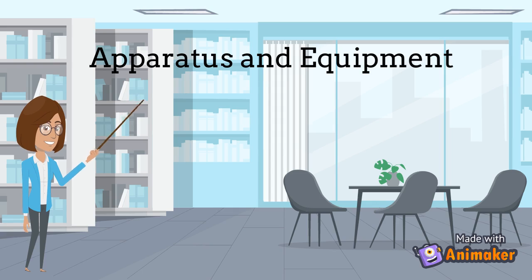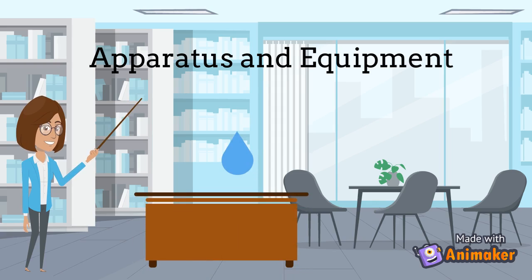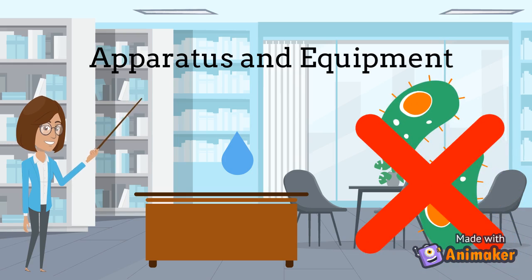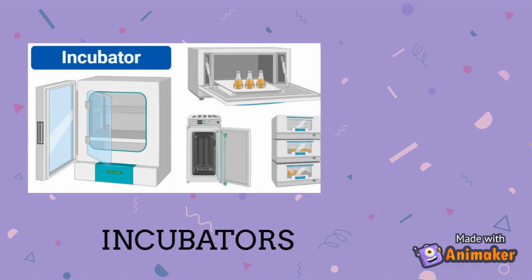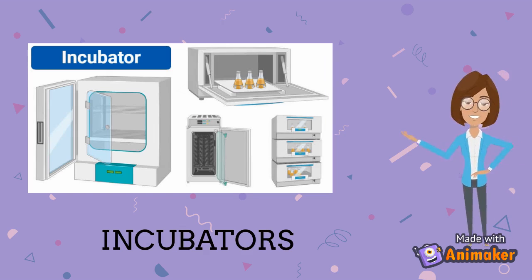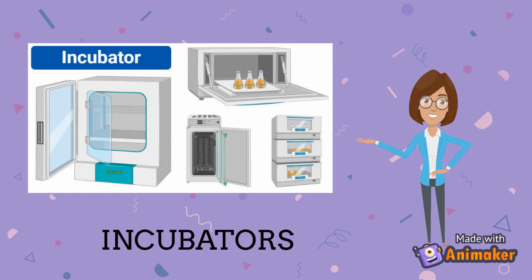Apparatus and equipment in the laboratory need to be cleaned regularly. This will help to avoid the production of dust and prevent microbial growth from accidental spillage. Firstly is the incubator. A humidified incubator is a source of contamination. It should be cleaned out regularly.